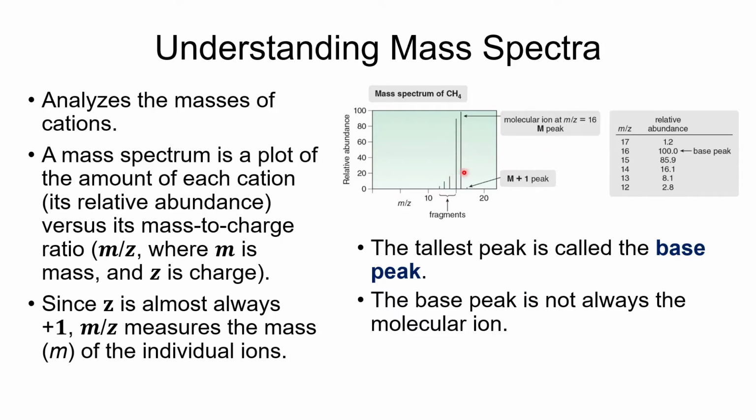All right, so here are some fragments. This is an example of a spectrum of CH4. Now, the mass of a methane molecule, CH4, comes out to 12 plus 4, so 16. And we'll see that our molecular ion is at 16. So that means that this is a radical cation at 16, and it happens to be the base peak.